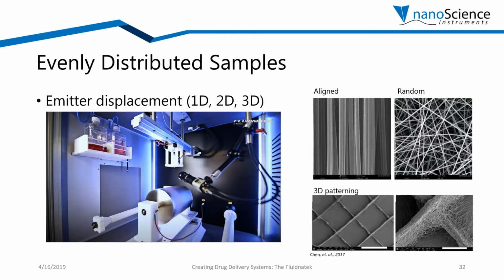So not only are we improving sample thickness, because the sample is collected all around that whole area. Depending on the RPMs that we use in this drum, we can create either aligned fibers or random fibers. For aligned fibers, we use high rotating speeds, and for random fibers, we use low rotating speeds.